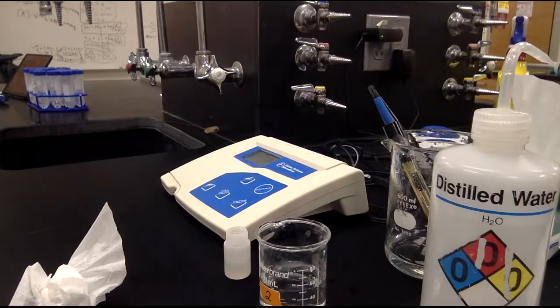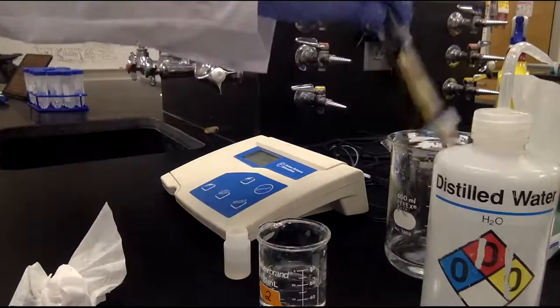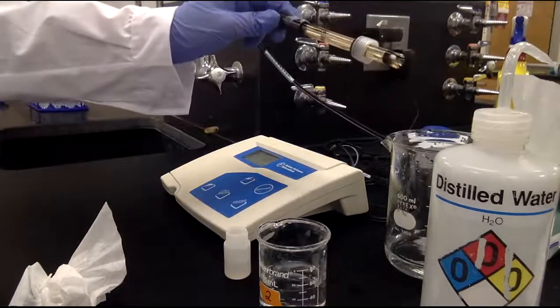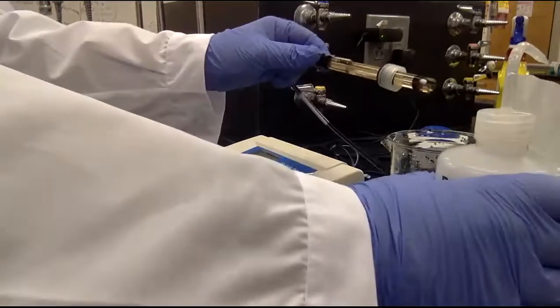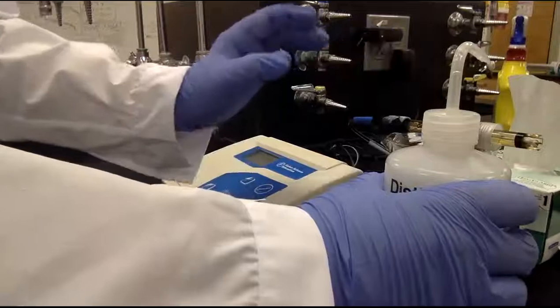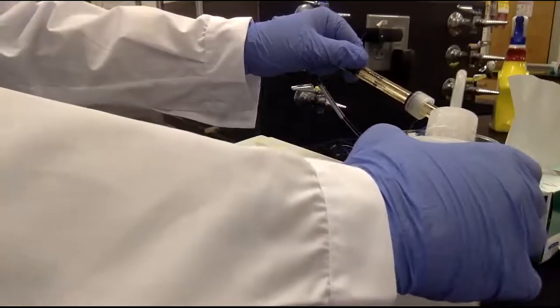Okay. So the second part is you never put the probe in the waste bottle because it's quite dirty. That's true. If you don't use that, you clean it, wipe it, then put it back into the protection. We're gonna use it again though, right? Yes, but you can hang it in the air, but you don't dip it in the waste. Right. Yeah, something like this. Okay. That works. Just gonna clean it up again. You clean it up first.